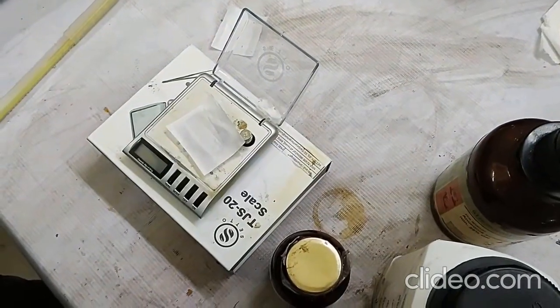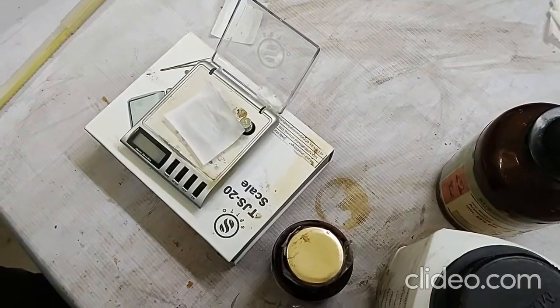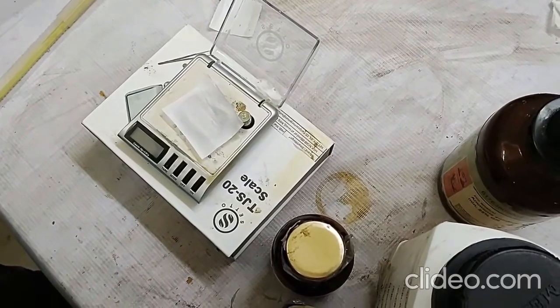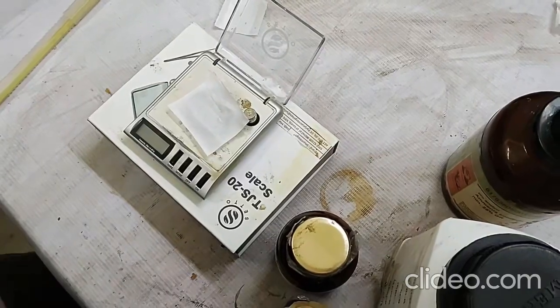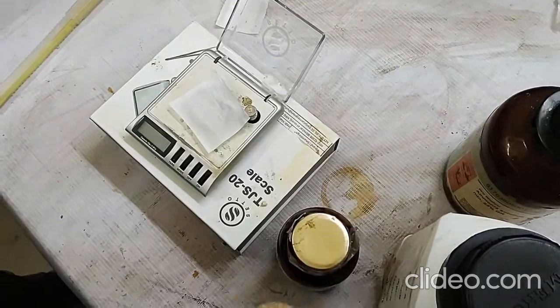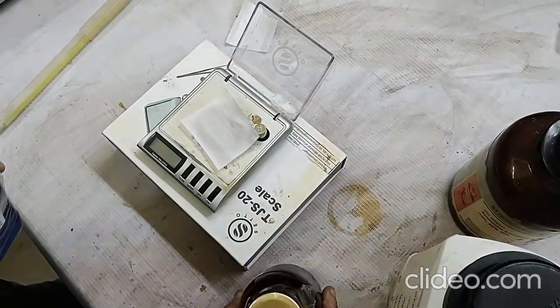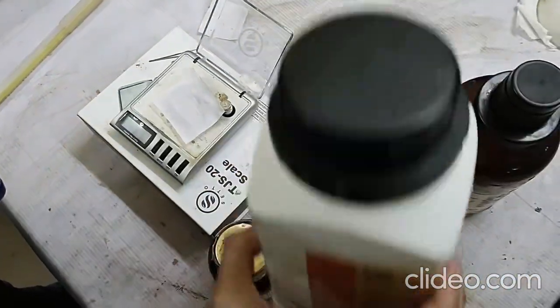One of the most promising methods to get the morphology of the sample is the hydrothermal method. Now we are showing you the entire hydrothermal process. Here we try to synthesize nickel cobaltite nanowire. For this, the required chemicals are nickel nitrate, cobalt nitrate, urea and ammonia.